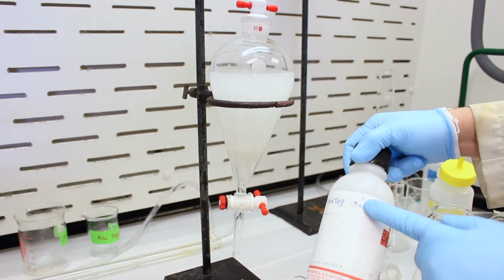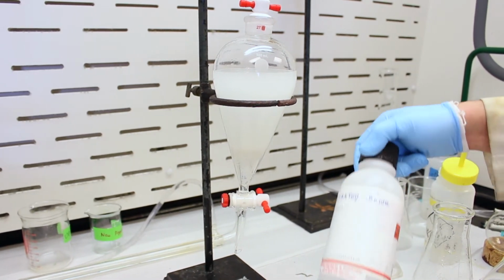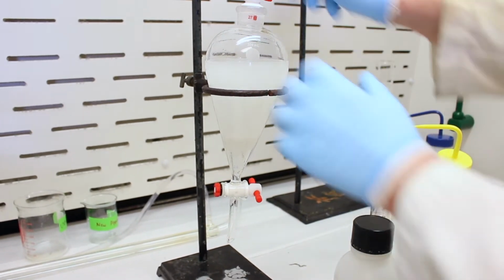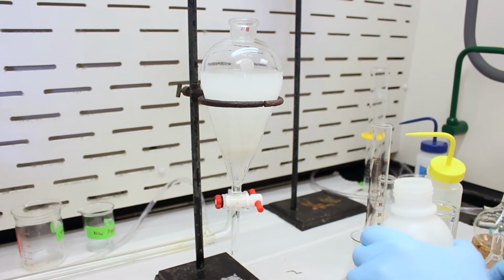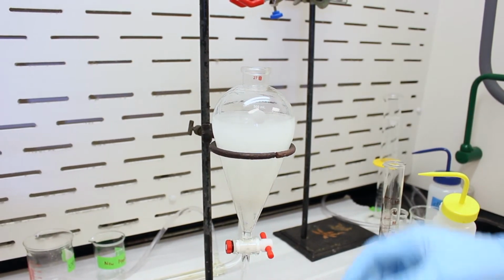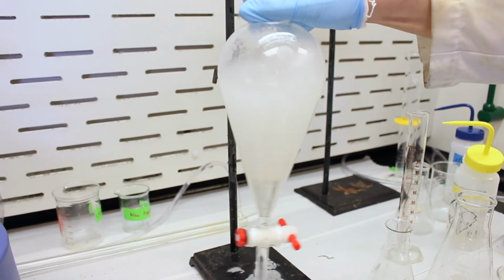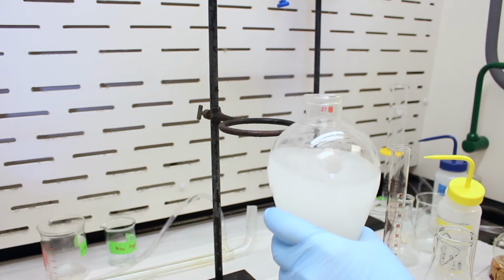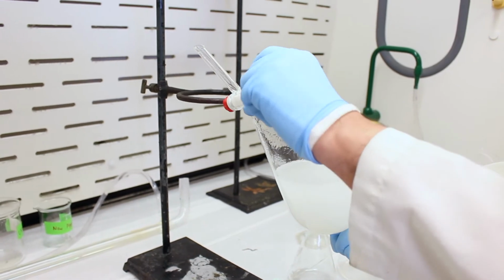Alright, so we're back. We've got some brine. Brine is basically a solution of saturated salt water, so sodium chloride and water. What it does is it forces the water bubbles to come back into the water layer instead of hanging out in the DCM layer. Sometimes this works very well and sometimes it doesn't, so we're going to find out here. We'll add a little bit. Maybe we'll give it a little bit of a swirl here. I think I will invert it, try to coax the water back into its layer.